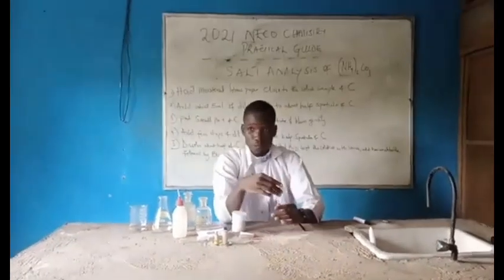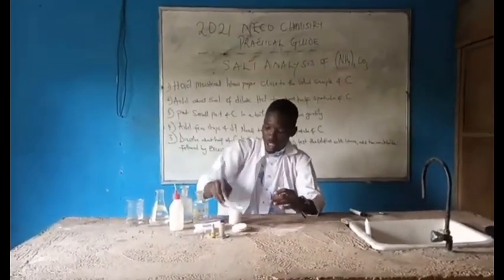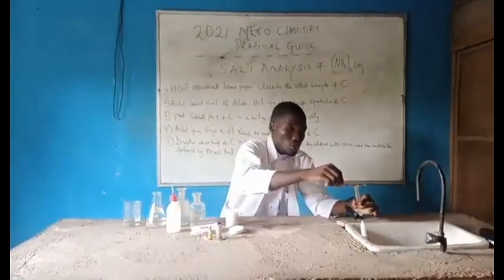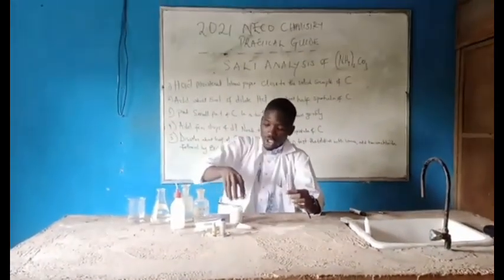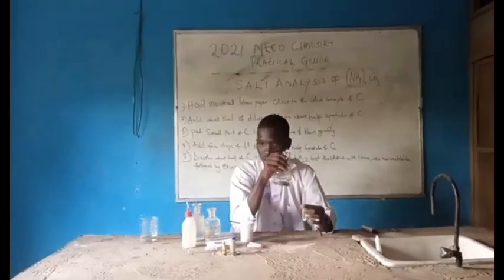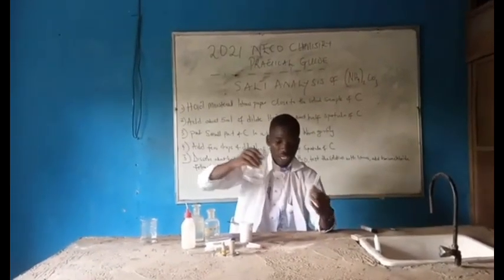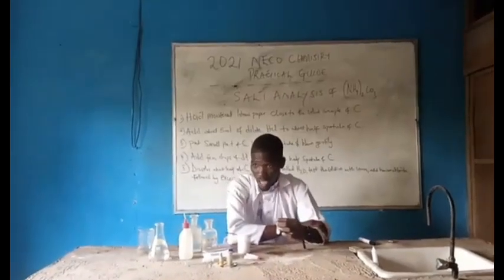So the next thing to do is that I will pour this out, then I will decide to use another test tube. And we can continue like this. Our sample C, a little, just add a spatula of sample C. Then your dilute sodium hydroxide. What did I call it? Dilute sodium hydroxide. So when you pour it, as you can see, nothing changes there. Are you with me now?